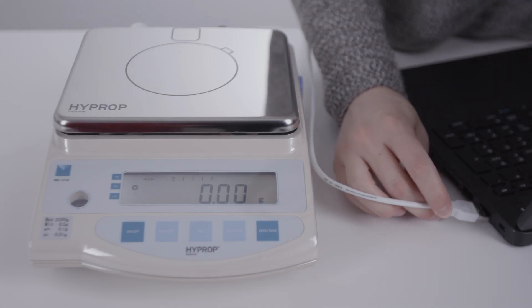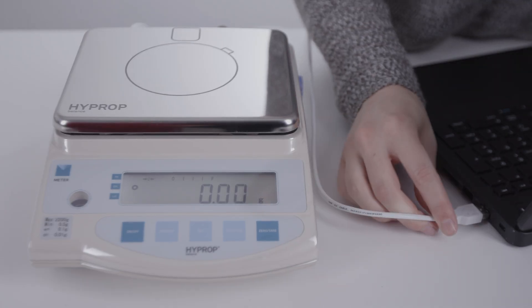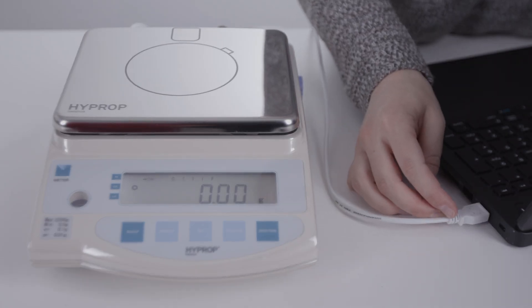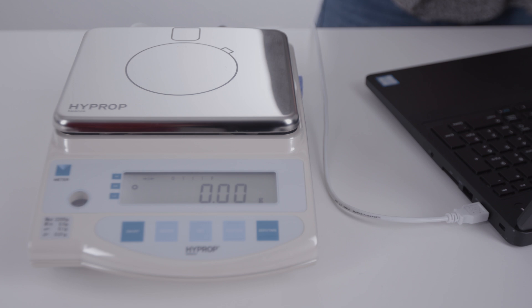After adjusting the balance, turn it on and connect it to the computer. For setup, there are two choices.